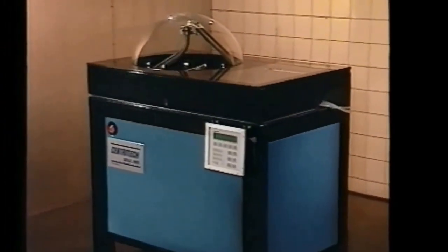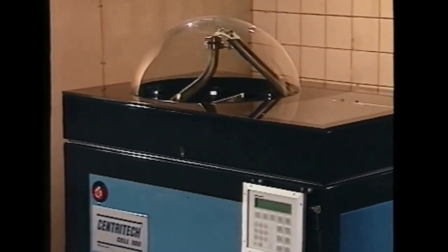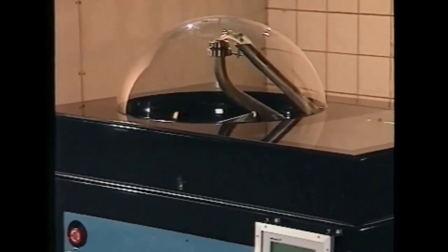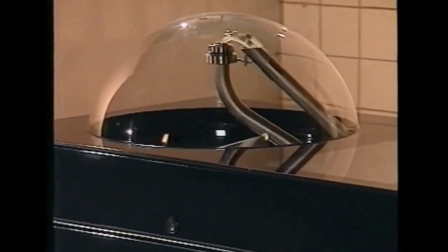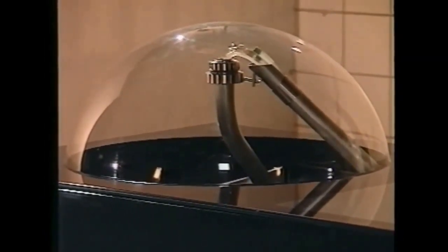The connecting tubes are totally sealed with the bladder and, in one piece, feed out to the fermenter and the downstream processing equipment. The associated shear stress and leakage problems are totally eliminated.